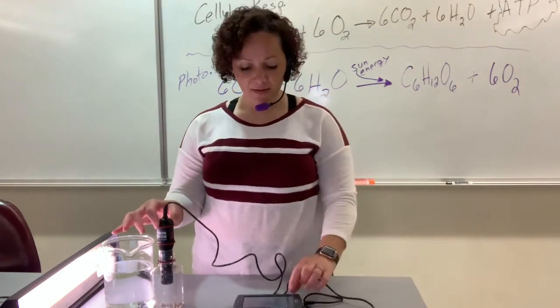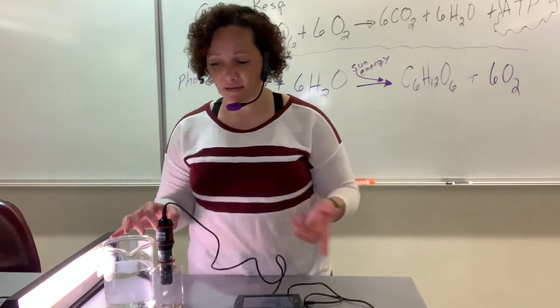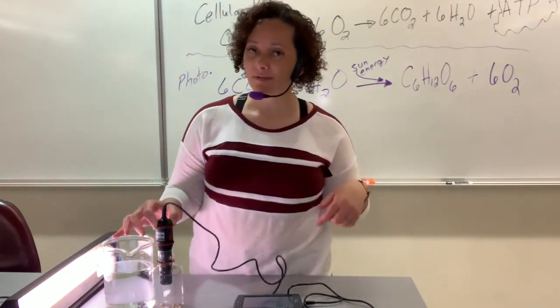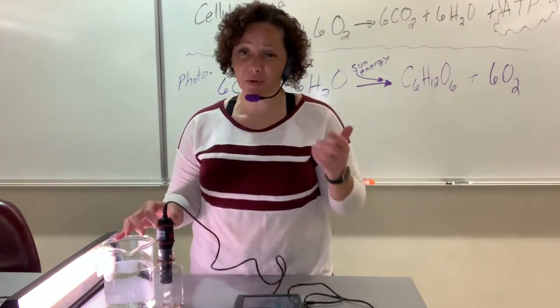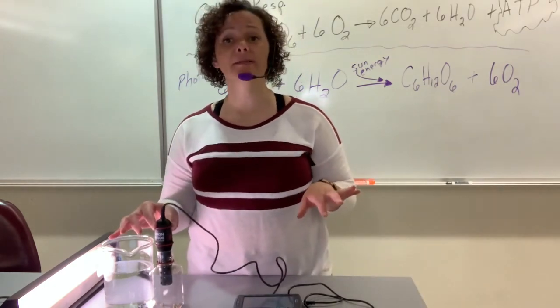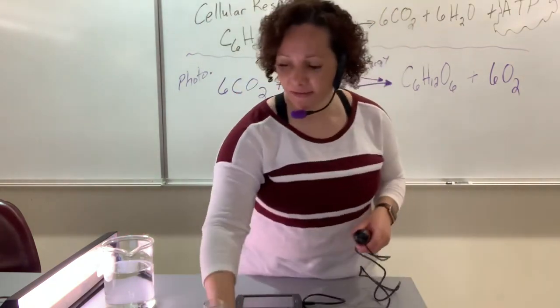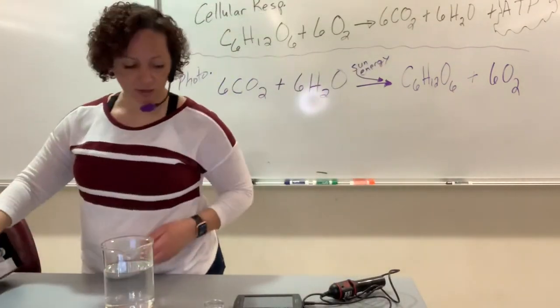Then once you get that data, you're going to write it on the next line, plant in the light. Remember, go in my order. It doesn't matter what order. I say do the dark first, then the light. That's just how I work. Alrighty. So then you do this 3 different times, the exact same way I explained before. Take the average. All right, friends. I'm going to go ahead and get rid of this light.